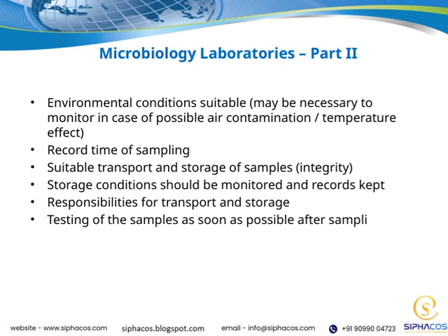Finally, try to test the samples as soon as possible after collection. The sooner we analyze them, the more reliable our results will be, especially in microbiology, where sample viability can decrease rapidly over time. In microbiology laboratories, these steps are vital to ensure the accuracy and reliability of our testing results, supporting overall quality and safety standards.